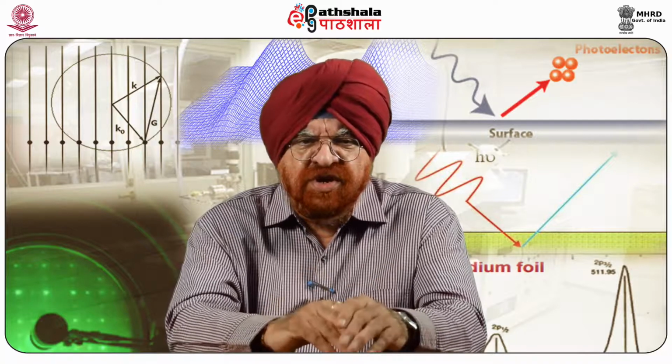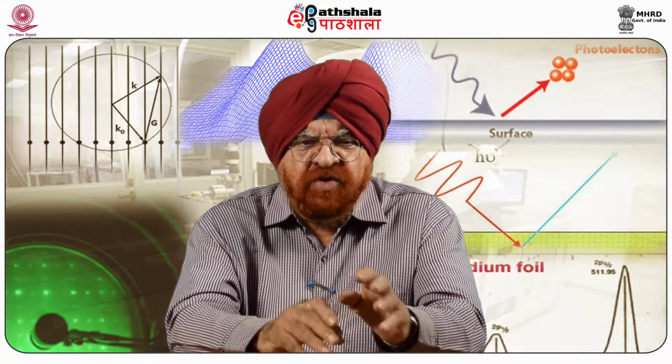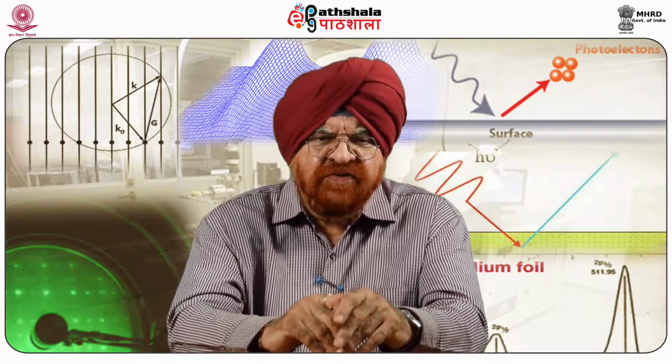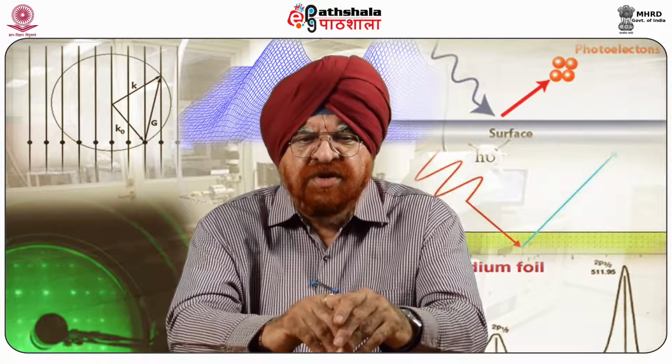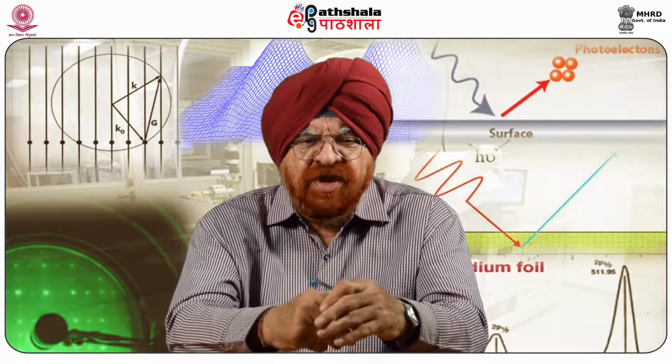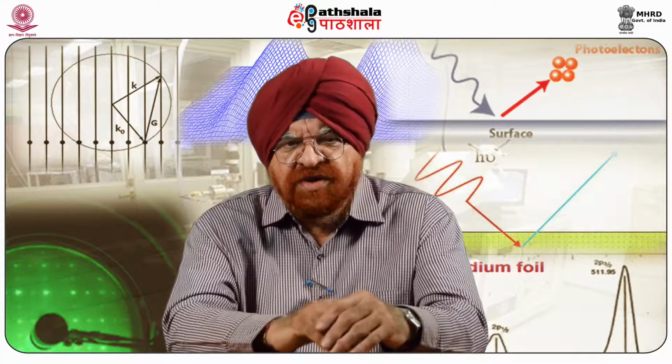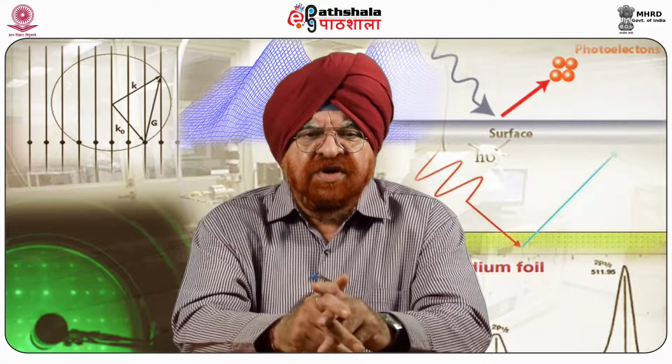It is interesting to observe the quite different topographic, that is AFM, profile and magnetic MFM voltage patterns achieved from the very same structure, exclusively due to the presence of magnetic activity. The effect of manganese on the formation of these magnetic vortices is also remarkable, suggesting that once the structure is formed, the Mn distribution is non-uniform and/or highly influenced by the presence of MnSi 1.7 around it.